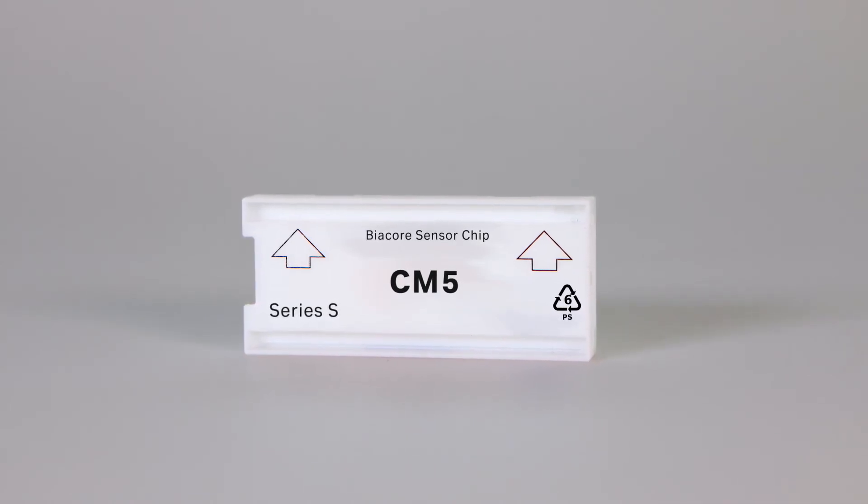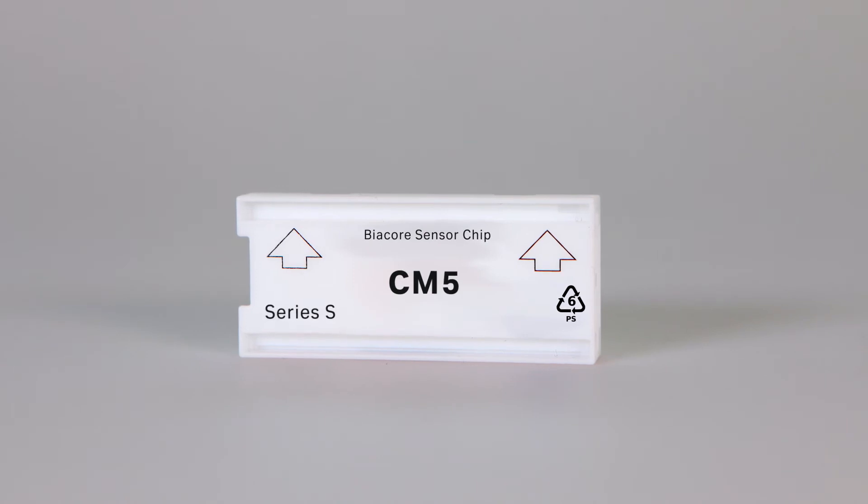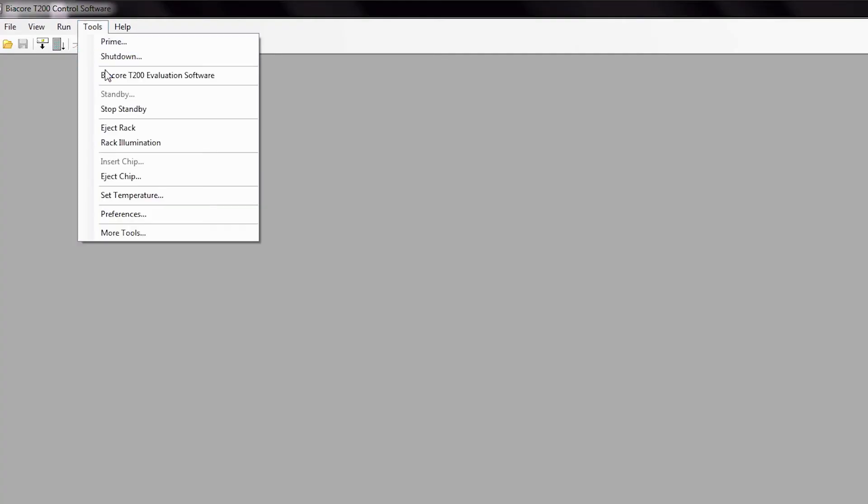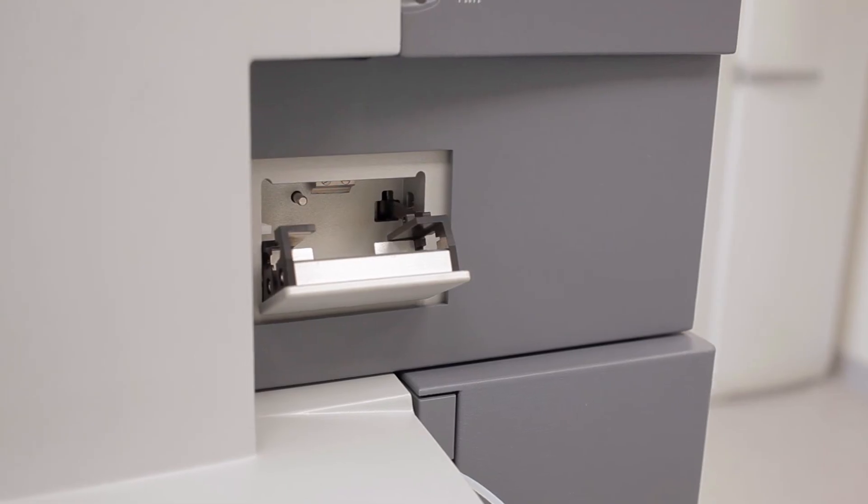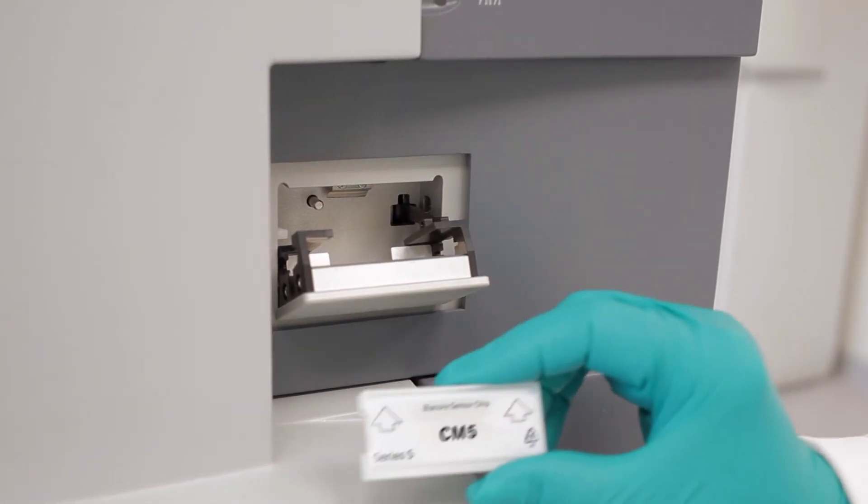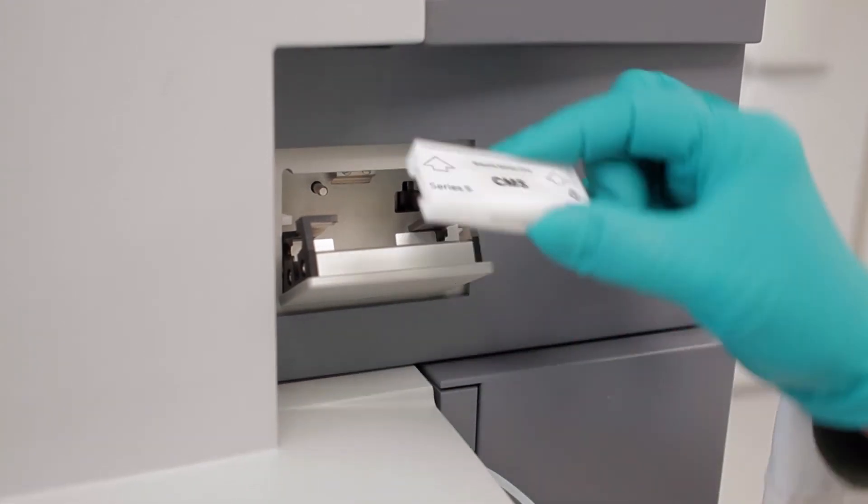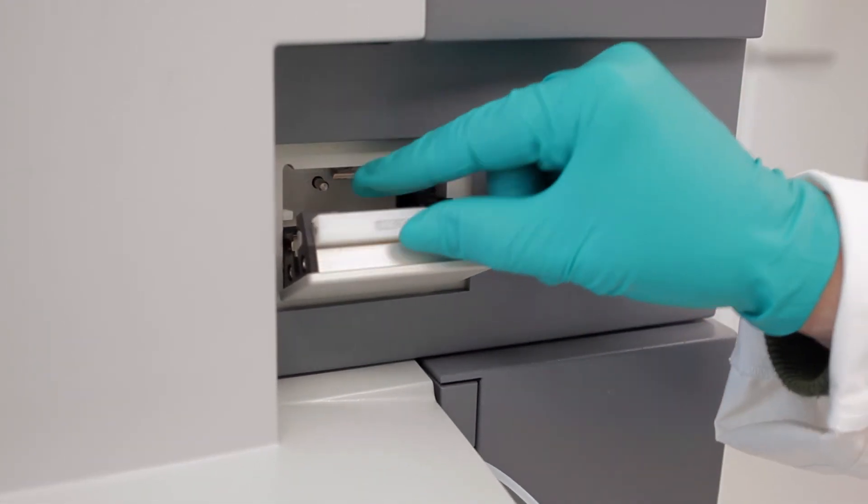If a sensor chip is already docked, check Eject Chip from the Tools menu. Remove and replace with a new chip. Insert the chip and press the door closed.